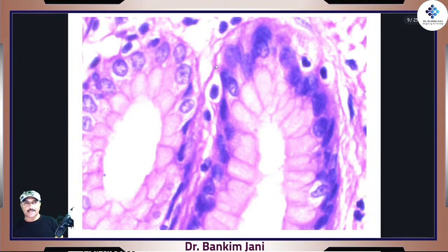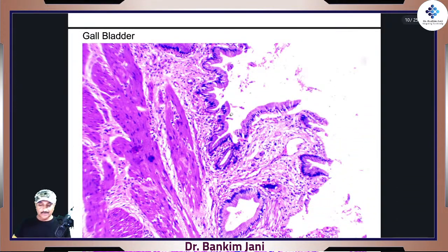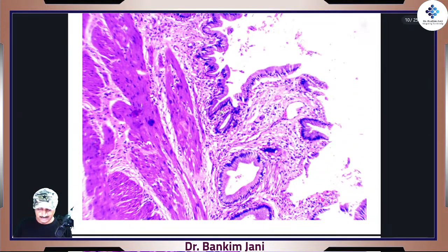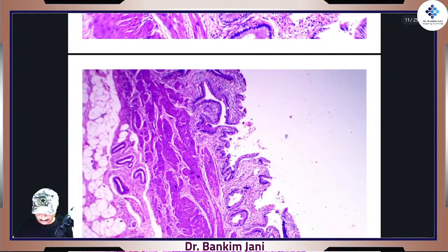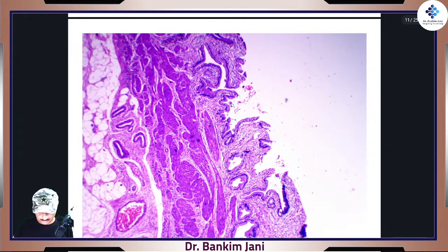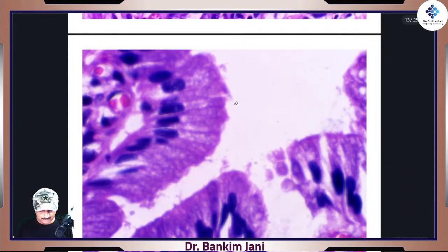Yes, lacteals can be seen. Moving on to the gallbladder, right? Gallbladder. This is a low magnification, not that appealing. Looks beautiful, but now we zoom it. We go still further, and here it is, right? What can be so extraordinary, right?